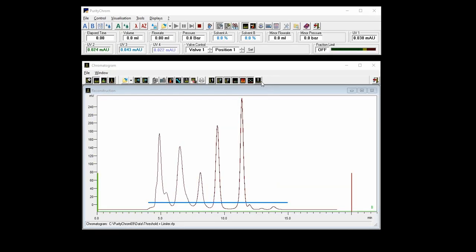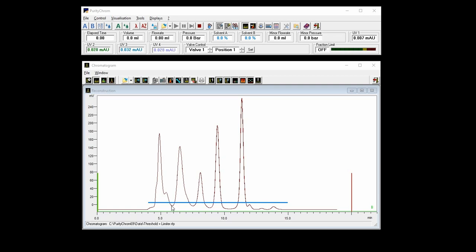The second fractionation possibility is the fractionation by a threshold, which is an optimal fractionation method for fairly well baseline separated and defined peaks. Here a threshold is set at a specific UV level indicated by the blue line as you can see here. And every peak or UV signal which is exceeding this threshold will trigger the fractionation by setting the fraction collector into the fractionation mode. If the UV signal falls below this threshold, then the fractionation valve will switch to waste and stop the fractionation.